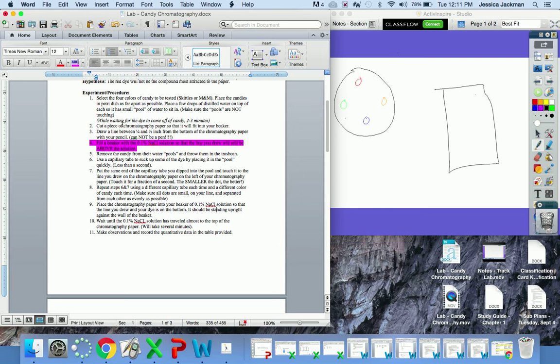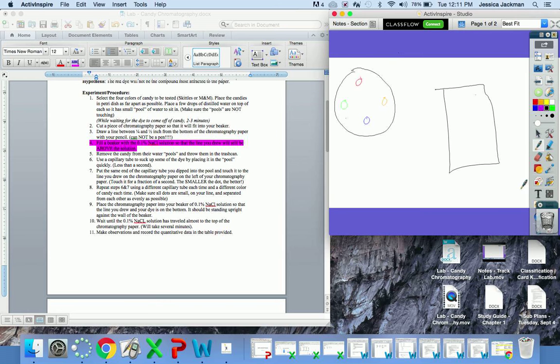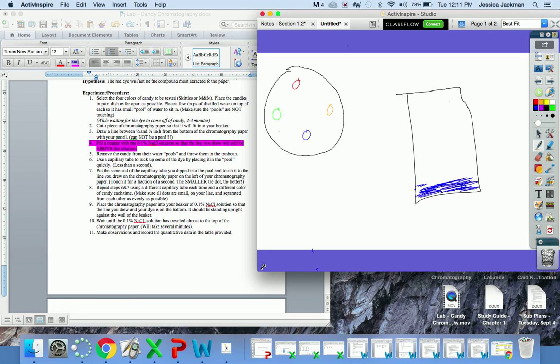So fill some beaker up. You're not going to fill it up, okay? You're not going to want very much. So if this is my beaker that I drew instead of my chromatography paper, you're only going to have maybe this much filled with salt water. Okay, not much at all. You're going to put your paper in it, and you're going to see what I mean here in a little bit. So, if that is your beaker, okay, you're going to take your chromatography paper.